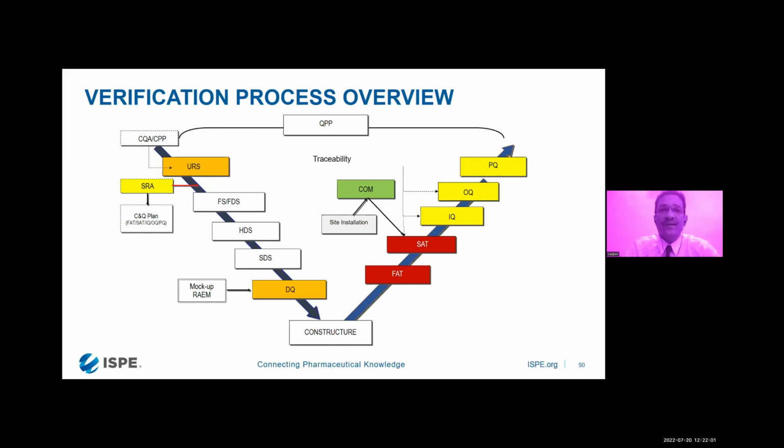Once the DQ is signed off, the construction of the machine starts. And then the first test that you are going to conduct, with the customer going to the supplier side because the equipment is still with the supplier, is the FAT. During the FAT, you are going to check the complete DQ and verify each and every point of the DQ, the makes and the models and the calibration range, that everything has been specified. And the numbers which are specified in DQ also appear in FAT.